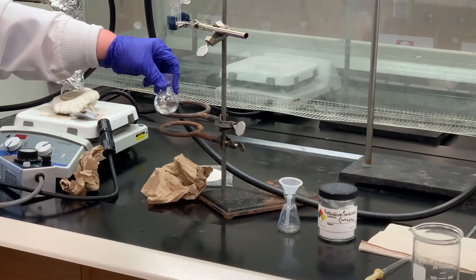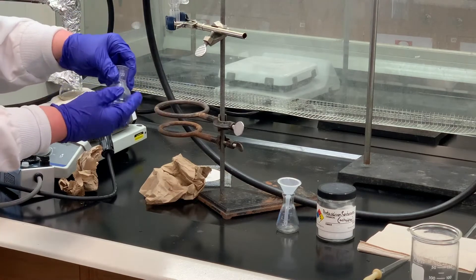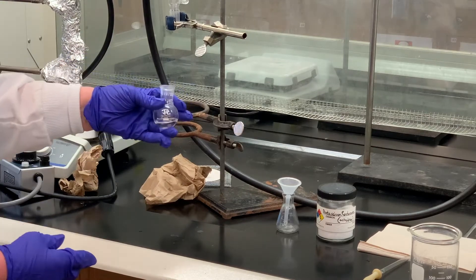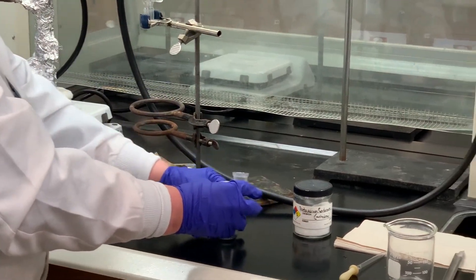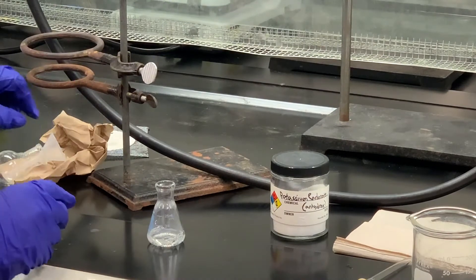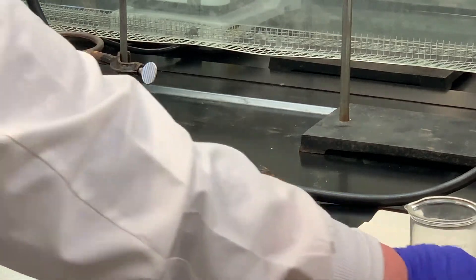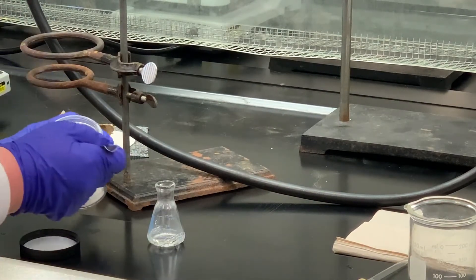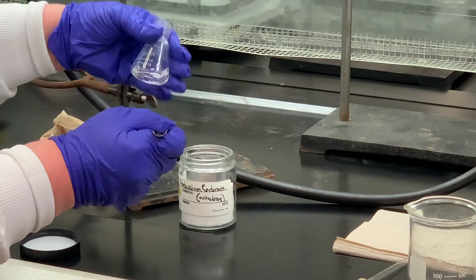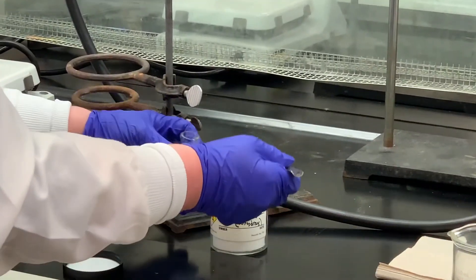Just removing the receiving flask from the fractional distillation apparatus. I've wiped off the bottom because I don't want to add any moisture. Remember to always wipe out the grease on the inside. I'm going to pour this into a small Erlenmeyer flask, and then add some of the anhydrous potassium carbonate. Swirl that around — if it clumps up, which this one did, I'm going to add some more. That tells me there's some moisture present.